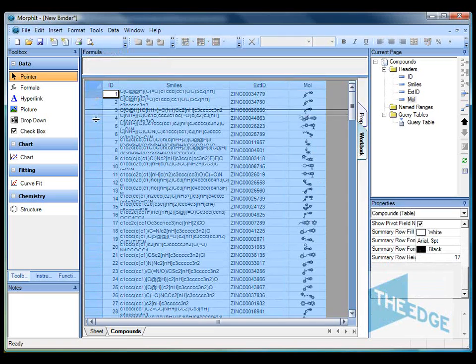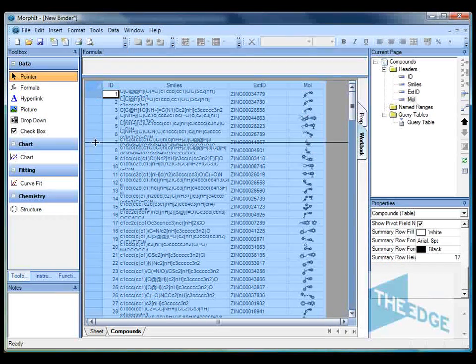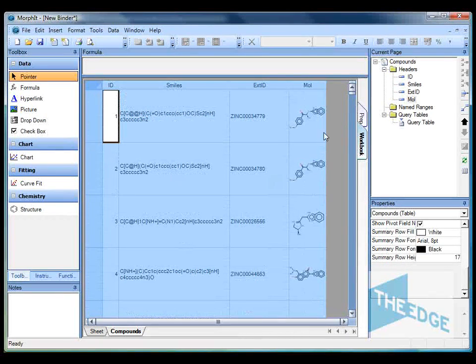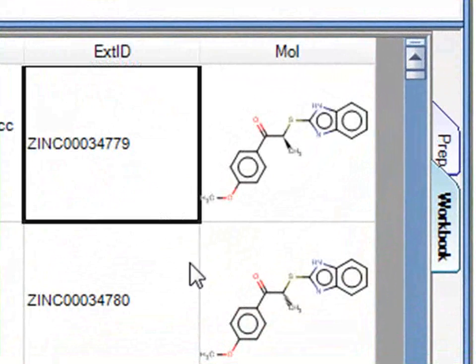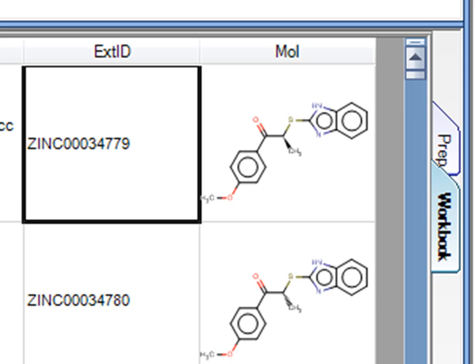So if I then increase the size of the cells you can then see a nice high quality rendering of all the structures in these smiles codes.